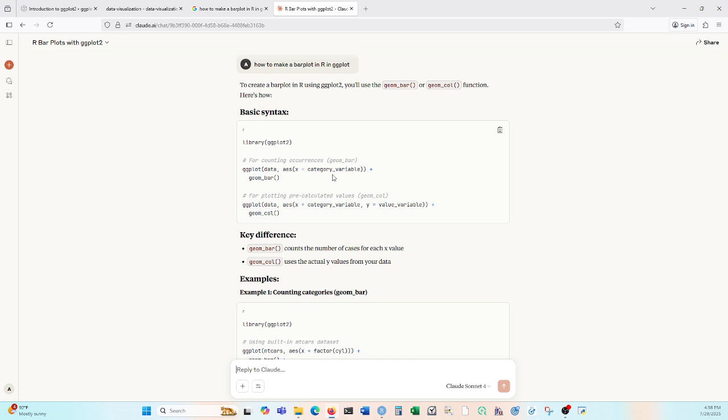And a lot of this stuff that these AI give you is very short code. So if you want to make something more complex, which right now you don't really need to, you need to ask it multiple different things and make multiple little programs and then link them all together into one big program. And you can't really do that without understanding how programming works and the thought process of how one program can lead to another and how to put them together.